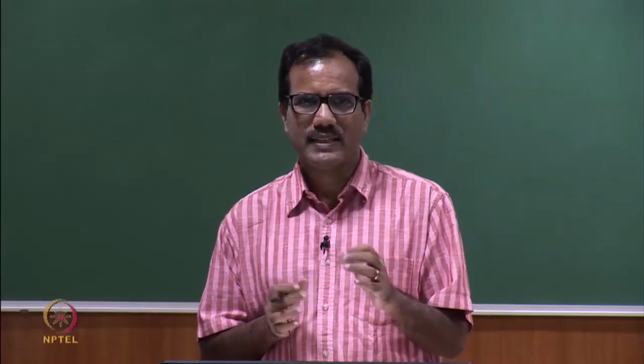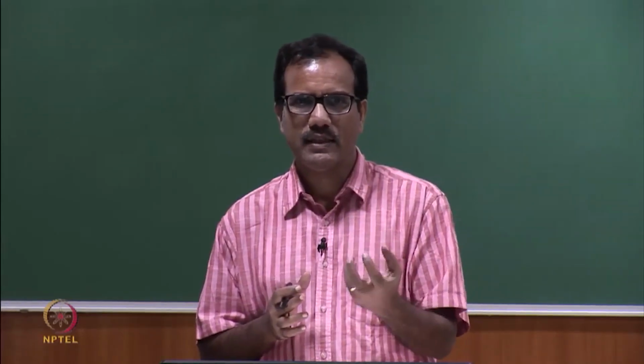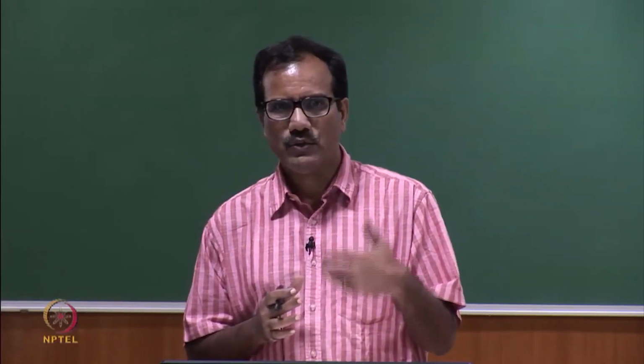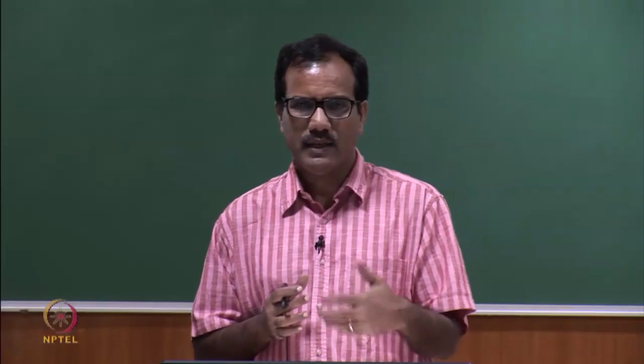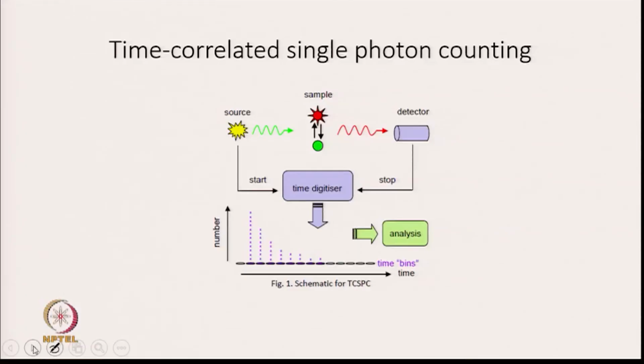One can then accept the sparseness of the collected photons and reconstruct the fluorescence decay profile from the multitude of single photon events collected over many cycles. I will explain this in the next slide. So, this is basically the way we do time correlated single photon counting.